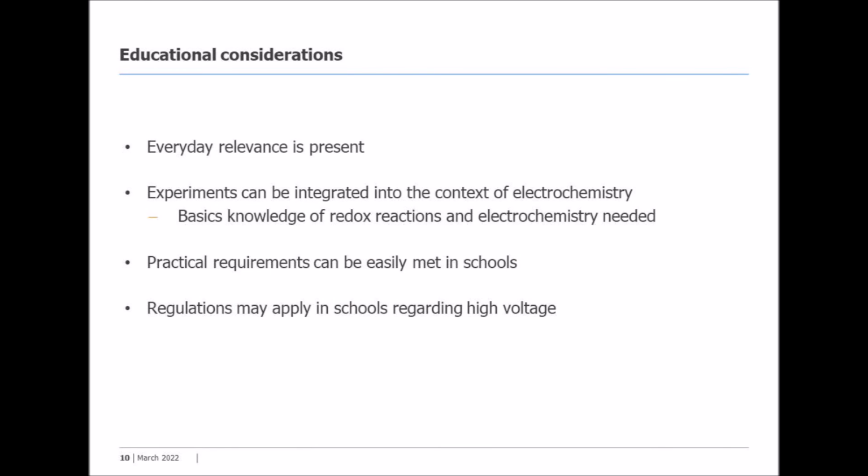Lastly, I would like to address the educational considerations for these experiments. We believe the anodic oxidation of titanium is a suitable topic for chemistry classes to combine basic electrochemical processes, physical phenomena like interference, and industrial applications for surface modification in visually striking experiments.